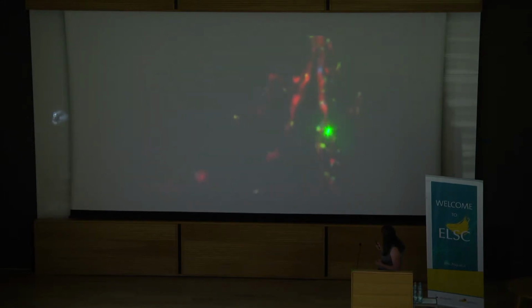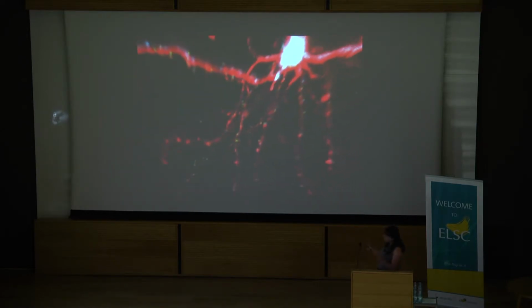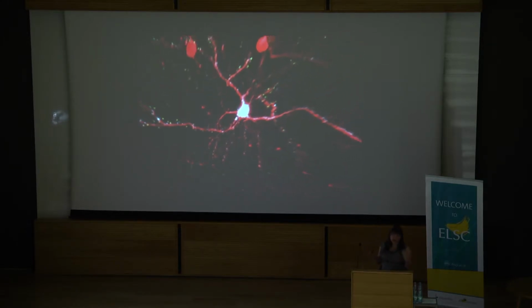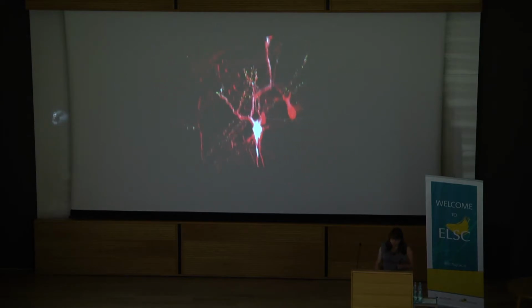And you can see them even when you go down to the deepest basal dendrites. You can score every synapse. Here you see the axon with the boutons as we pop out. So we have a good view of the cell and all the synapses on this cell, both excitatory and inhibitory.